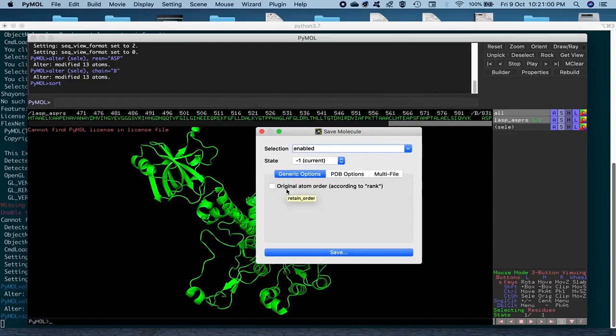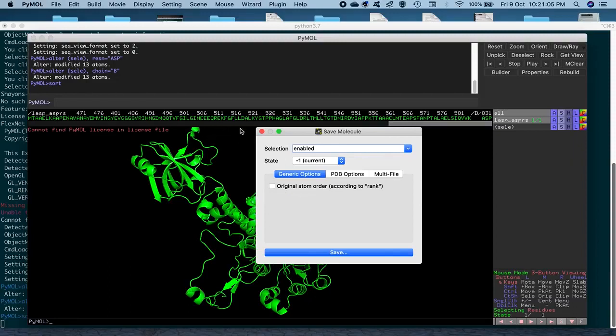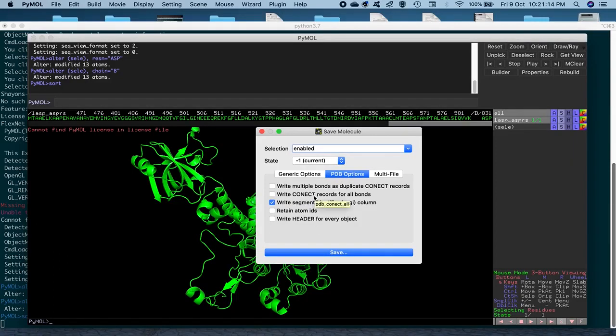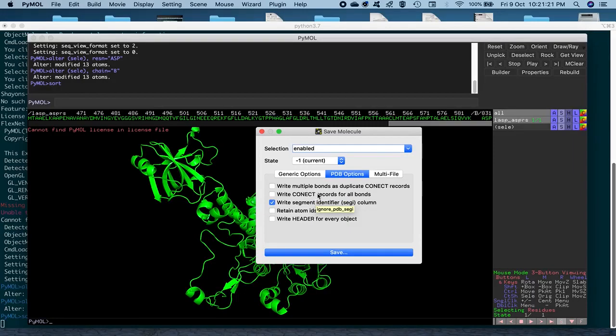Like you want the original atom order. You can click on it, and it will retain the order of the atoms that was there in the initial PDB structure that we loaded. And then there's other PDB options, like Write Connect Records, which is basically a connection of the covalent bonds that are being found between different atoms. That's written as an index of the atomic numbers. And then you want to retain atom IDs as well, if you want.